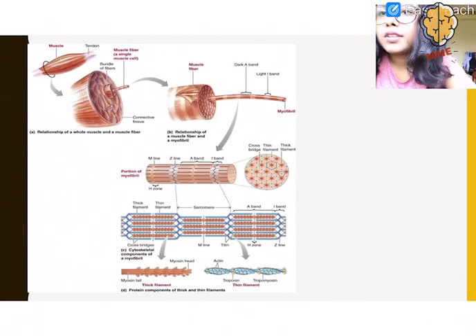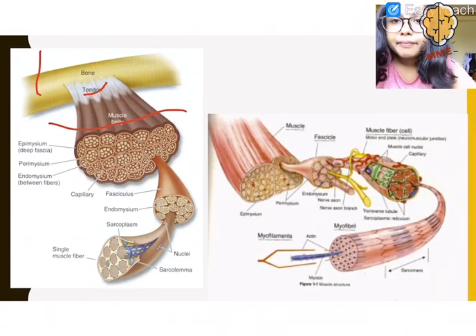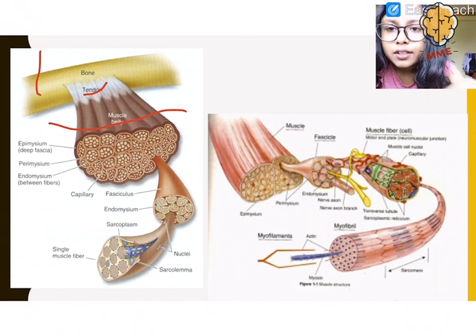The very good picture. Where is the good picture? Can't find my picture that I added. The picture has gone blurred actually.